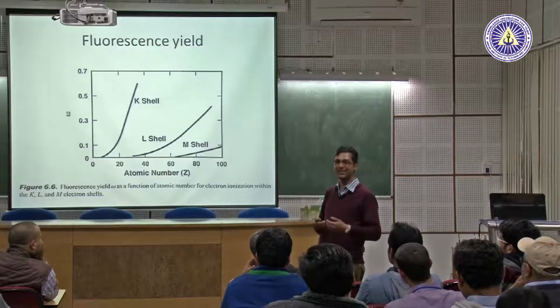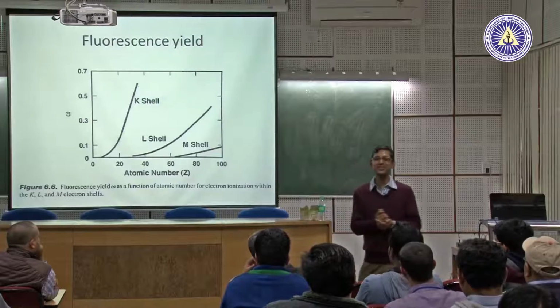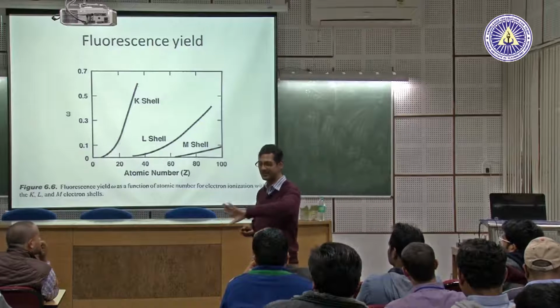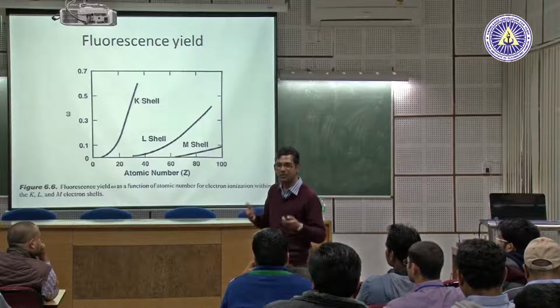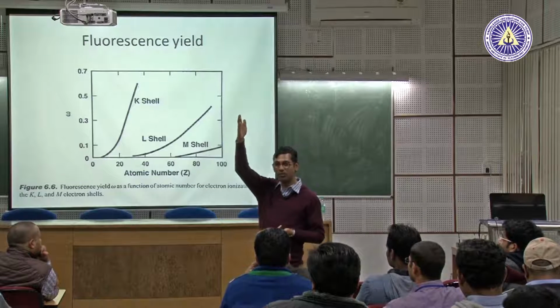It absorbs, right? Then what does it do? Deposits. Think a little differently. Okay, let me tell you. How many of you have seen the zinc sulfide screens? Have you seen the white zinc sulfide screen on a TEM? It's a fluorescent screen. What does it do? These are fluorescent lamps. How do they operate?